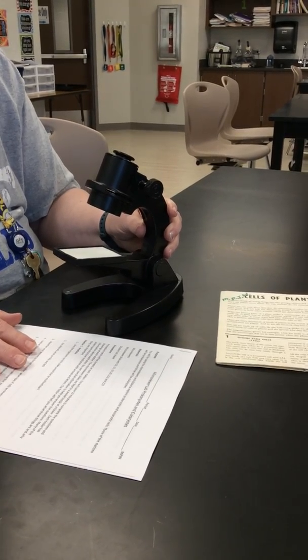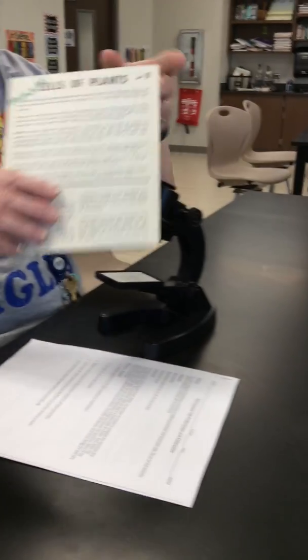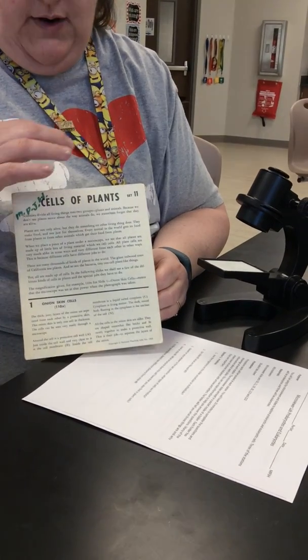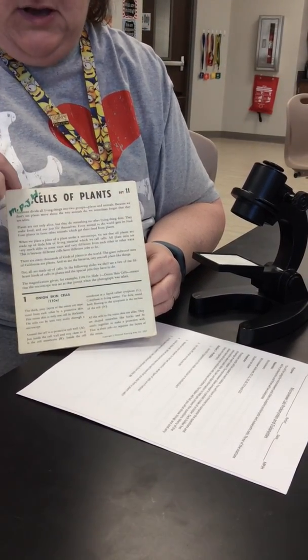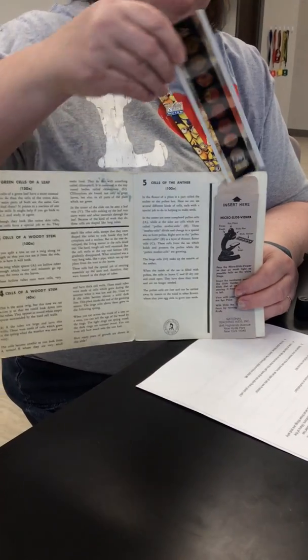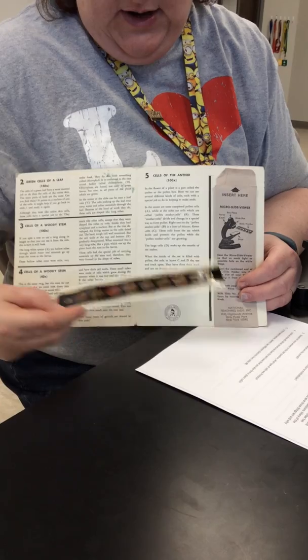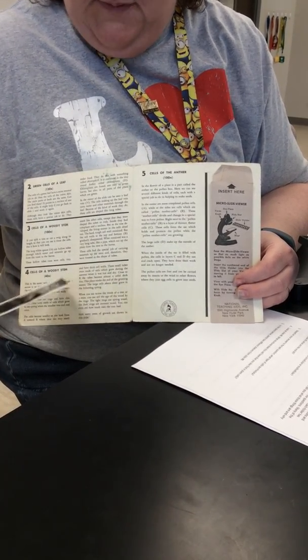You'll have six different stations that you'll be going to, and at each station there will be a card like this — this is what comes with the micro viewers. These are really great because it tells you what is on the slide. These happen to be plant cells, and for each slide — which looks like a piece of film — each one is numbered. This one has eight pictures on it, and for each one it tells you what it is and gives you information about it.